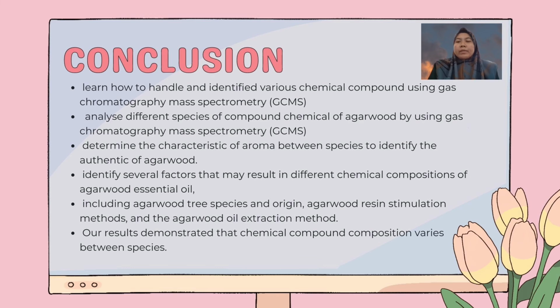We also identified several factors that may affect the chemical composition of agarwood essential oil, including agarwood tree species and origin, agarwood resin stimulation methods, and agarwood oil extraction method. Our results demonstrated that chemical compound composition varies between species.